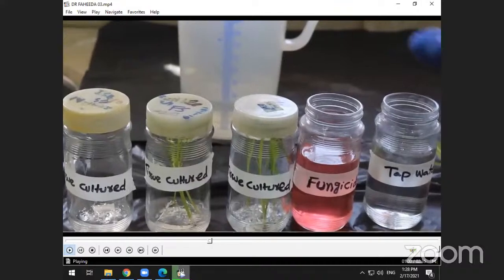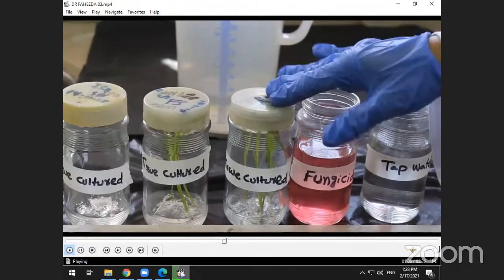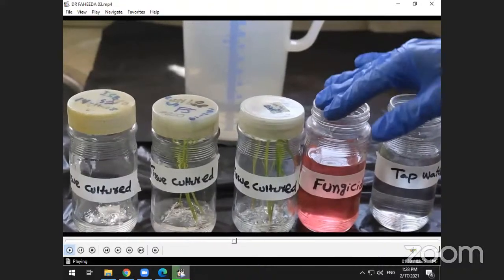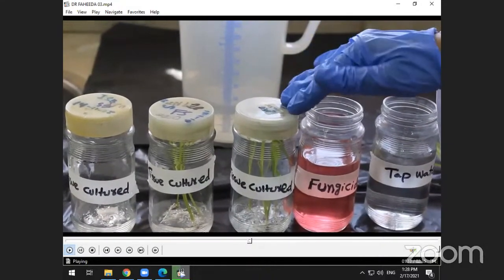After tissue culturing, the last stage of micropropagation is called transplantation or hardening in the greenhouse. This step is called acclimatization because before exposure to the direct sunlight in the field, plants should be grown in the greenhouse.